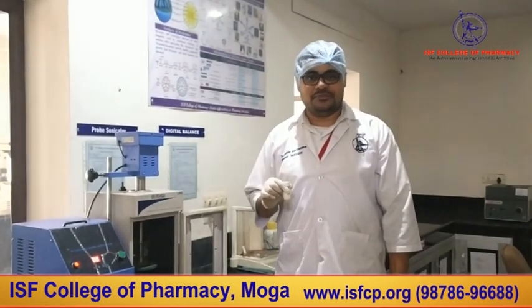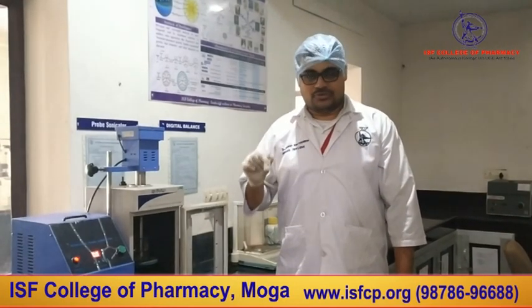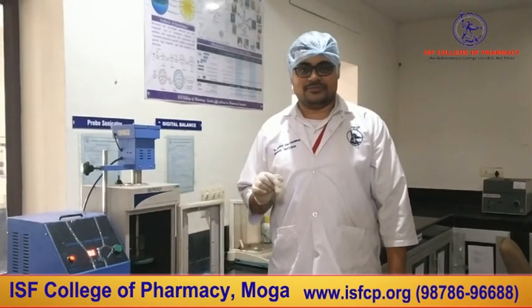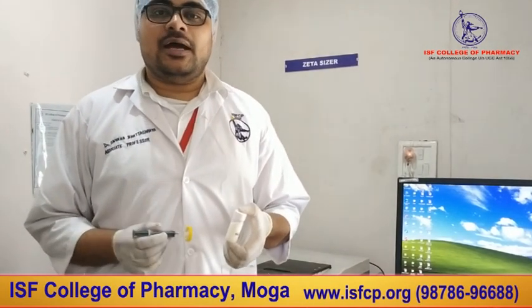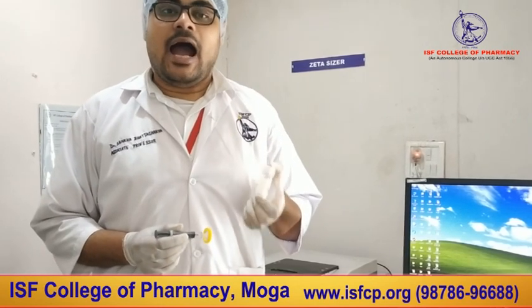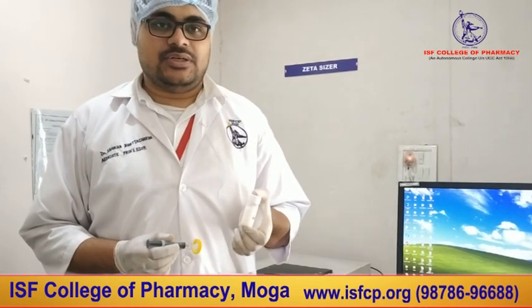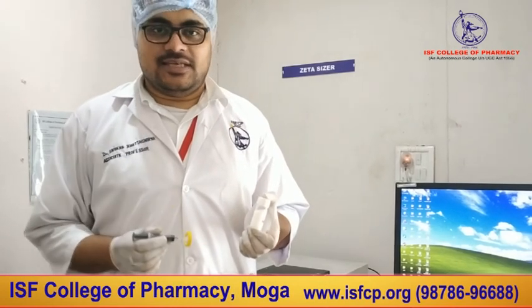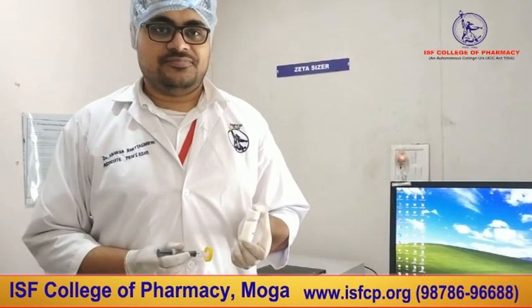After probe sonication, we will be going for characterization using a particle size and zeta potential analyzer. As you know, we already prepared nanonized nano-emulsion by utilizing the high-speed homogenizer and probe sonicator method. Next step is to filter utilizing a 0.22 micrometer membrane filter.